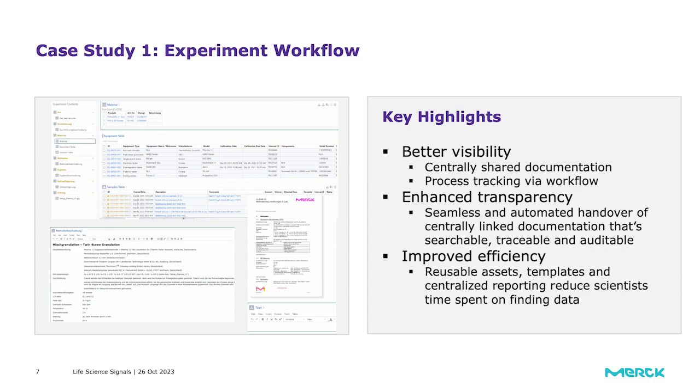In this case, you will find the right structure setup and template setup in the Sigma ELN. On the left side, you will see the background, the introduction, the description, each section fitting the needs of the workflow, and the details of the instructions, and then the materials and the materials table defined in the experiment, as well as, at the bottom right, the results uploaded to Sigma.